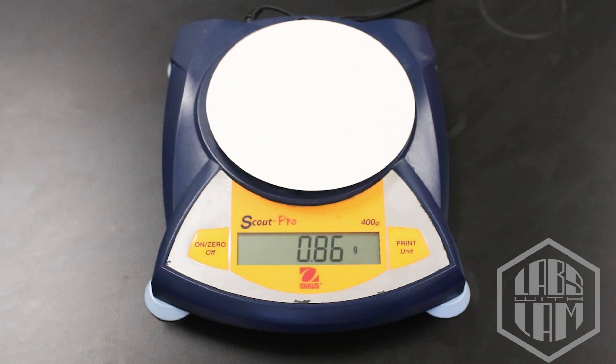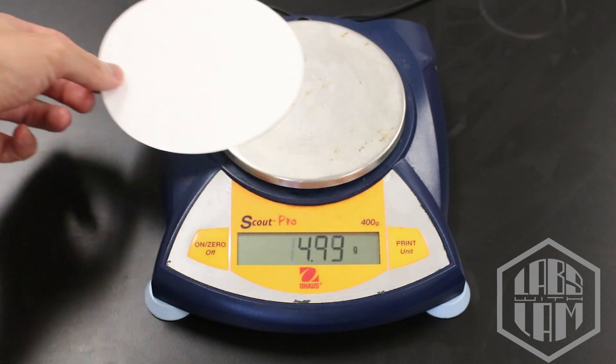First up is our dry filter paper. We're going to need this for later, so make sure you write the mass down in your observation table.